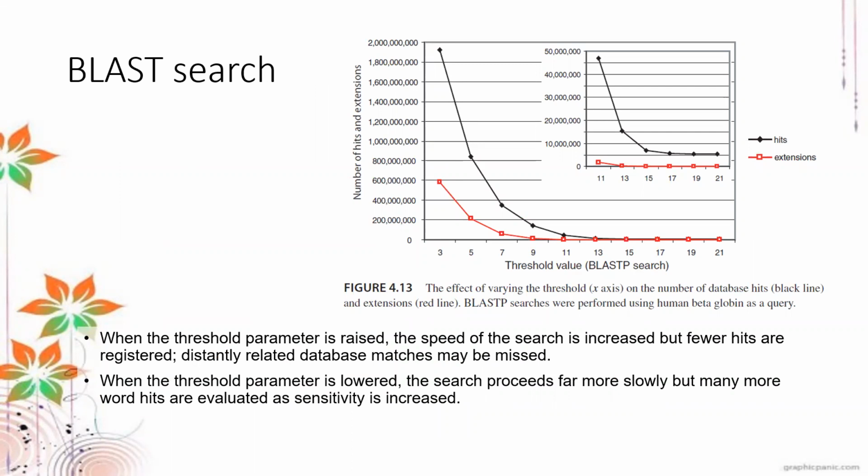So it depends on whether you want fewer results or many more results but with lower alignment scores, meaning you have a low scoring alignment. But for a higher threshold, you get more limited results, but with higher alignment, so much closer in terms of the identities you have.